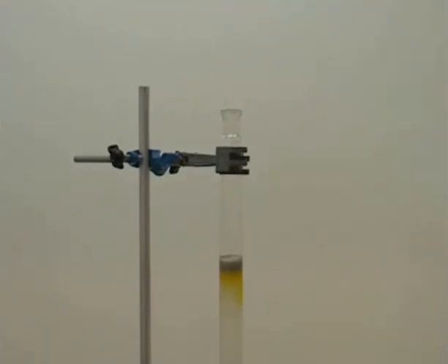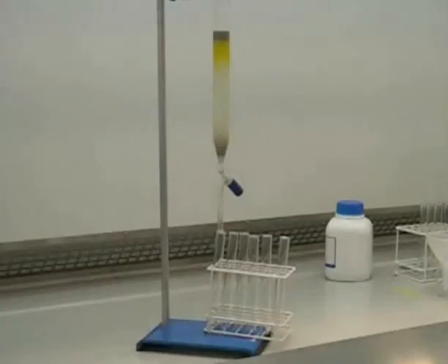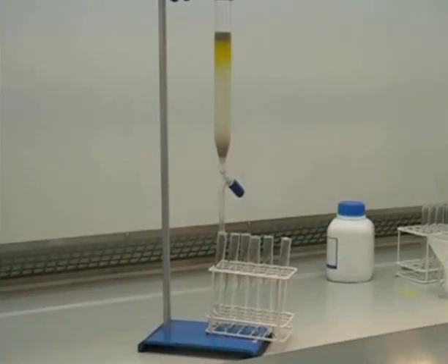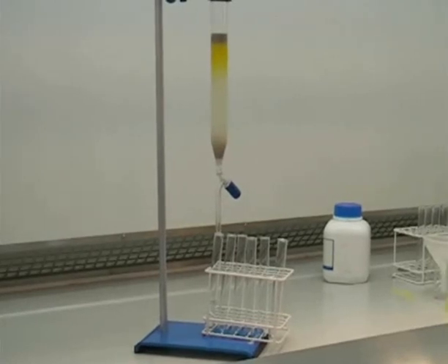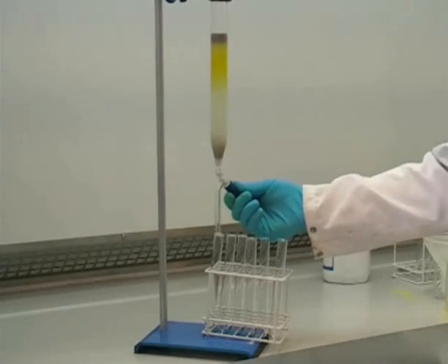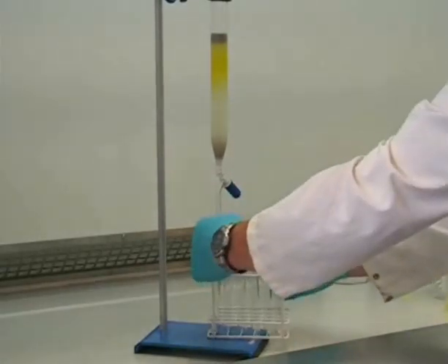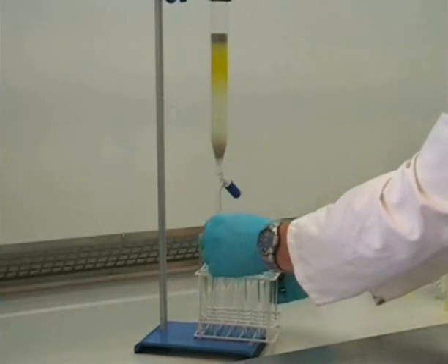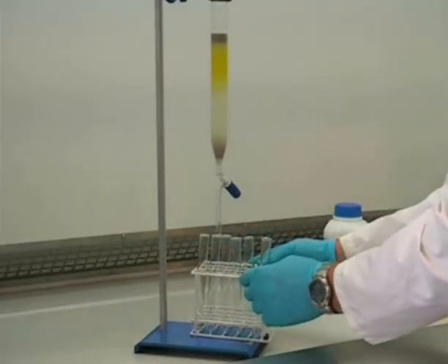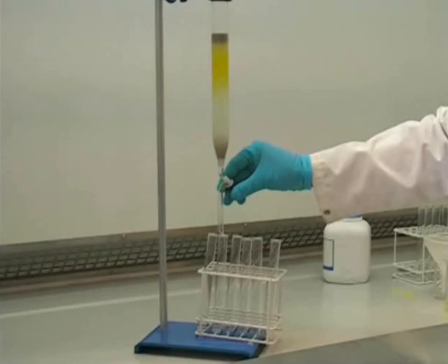And we're now ready to run our column. So we open the tap at the bottom of the column and this allows us to collect our first fraction. In this case we're collecting the fractions in test tubes. But depending on the size of your column, you may use sample vials or even conical flasks. Once collection is complete, we can close the tap momentarily to move on to collect fraction number 2. This process can be repeated any number of times to collect as many fractions as are required.